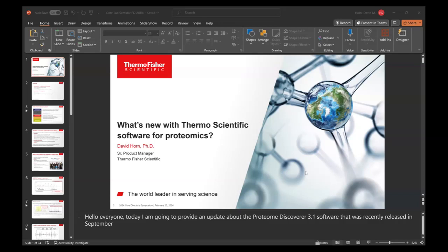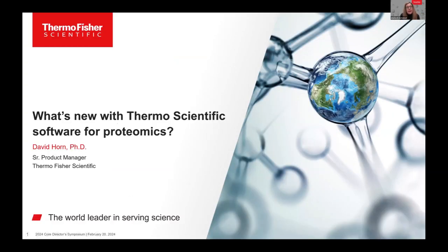Yeah, nice talk. So that slide where you mentioned combining the Seer technology with plasma proteomics. What volume of serum do you use for those studies? Do you need more serum for those? No, the Seer workflow you can do from 20 microliters of the plasma up to 250. And then adding the 250, a higher volume of the plasma, actually allows you to enrich the lower abundant proteins a little bit more, right? To get to the mass spec detection limit. But you can use it from 20 microliters per sample. Okay, thank you very much. Sure.